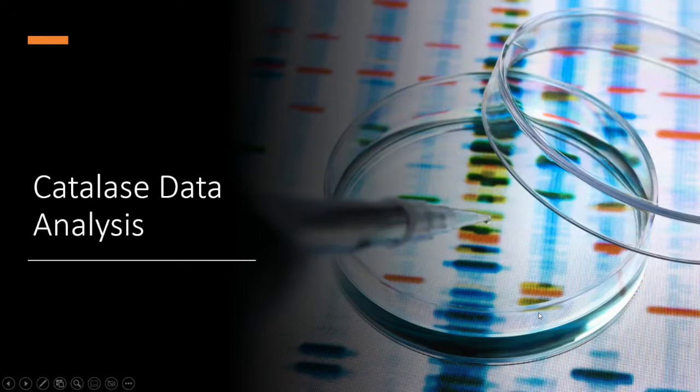Hi everyone, this is the Catalase data analysis. This is after you guys have done your lab, and we're going to learn how to make the graphs.